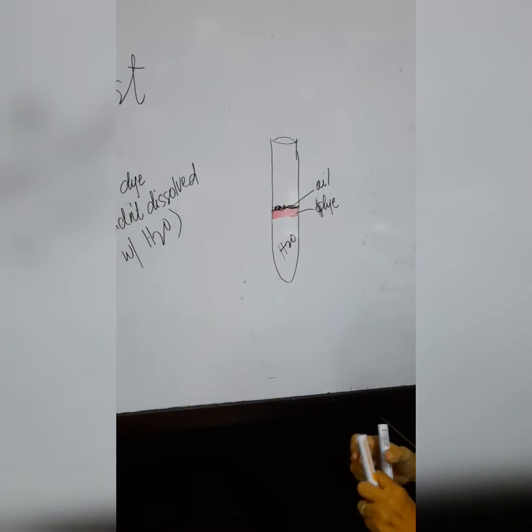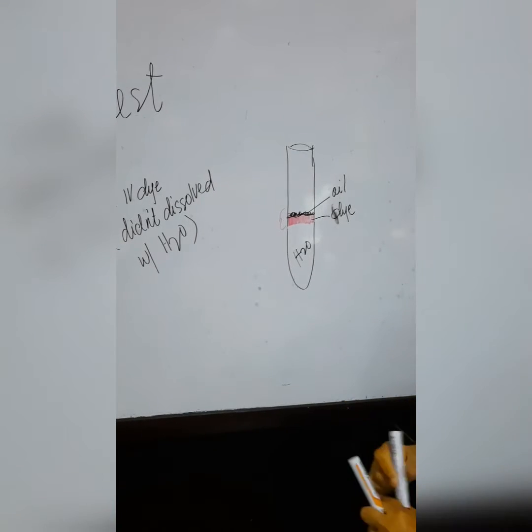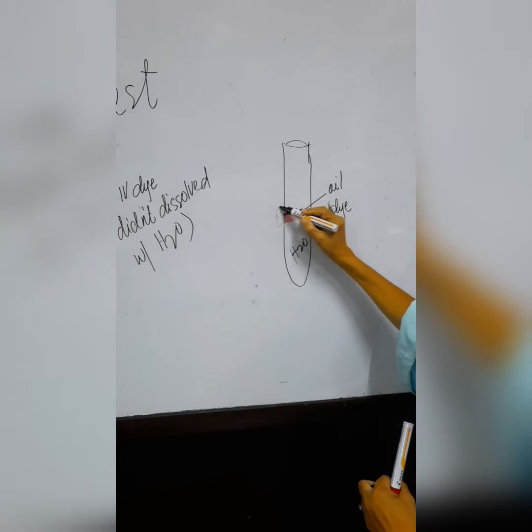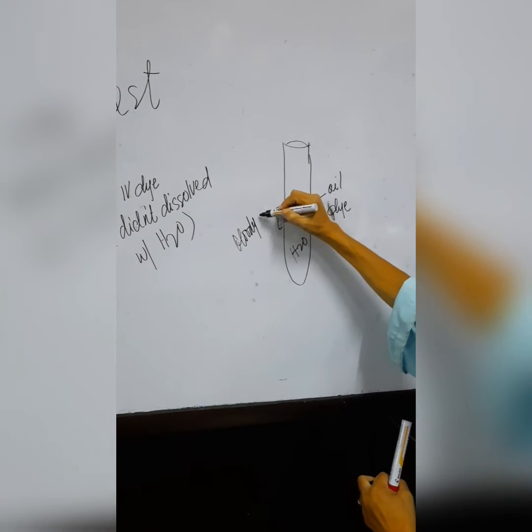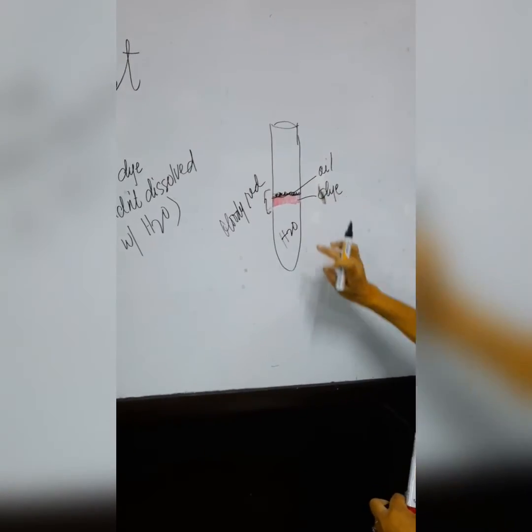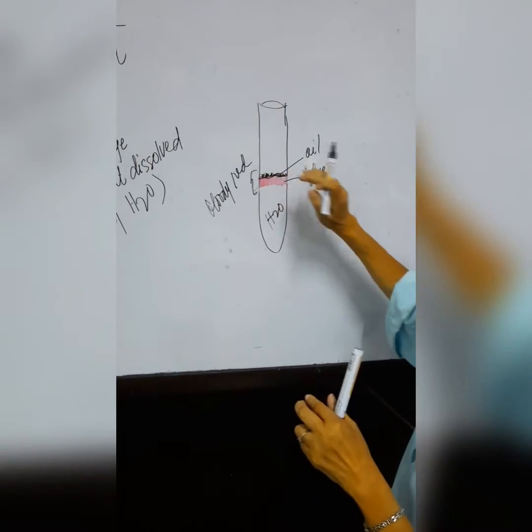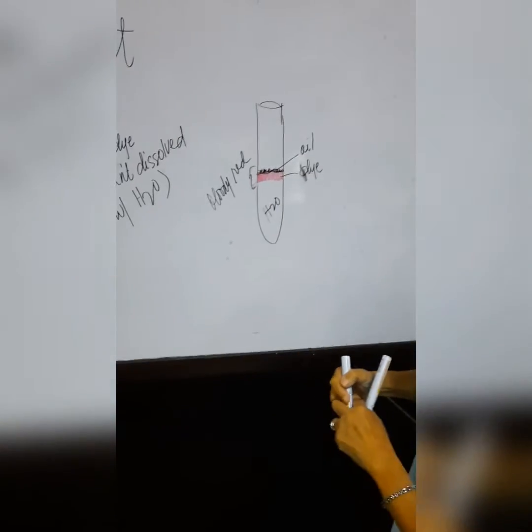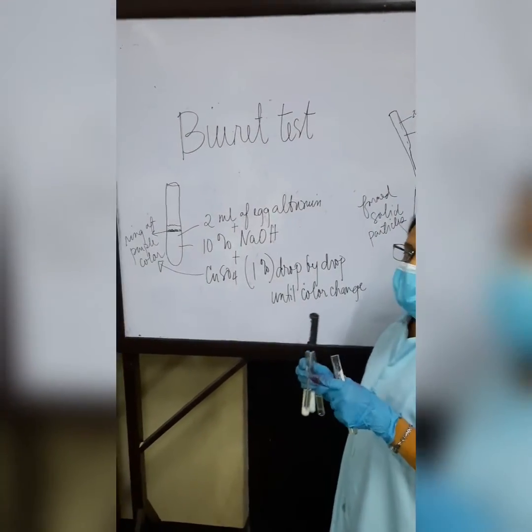Now, what happened here, class, is that the mixture becomes bloody red upon the addition of oil. And also, the oil plus the dye didn't settle to the bottom, but instead remains at the surface of the water. Now to continue, we will be testing for the presence of protein.